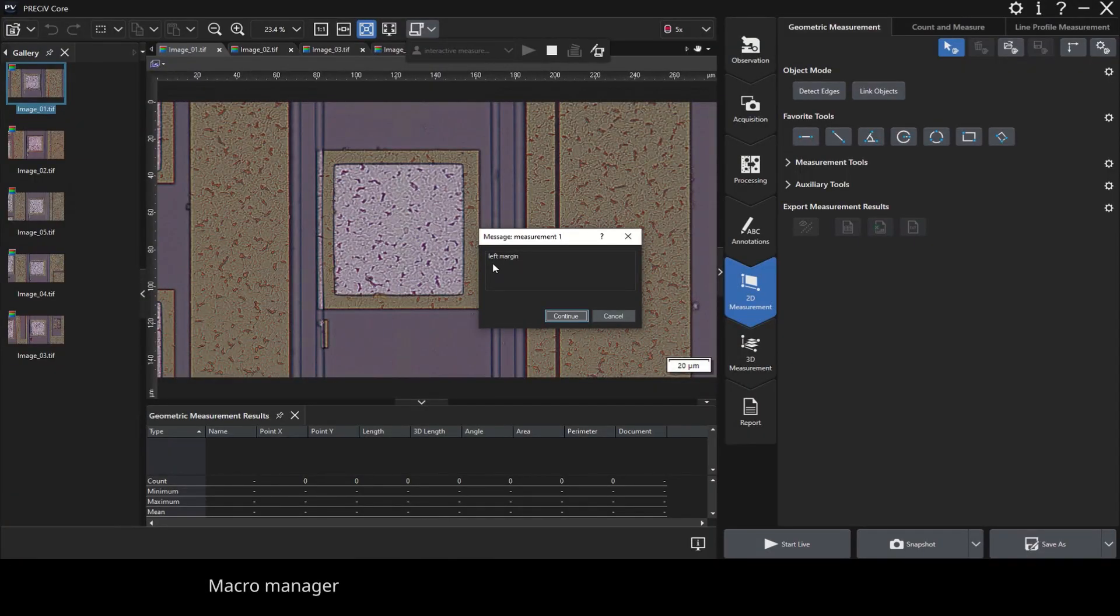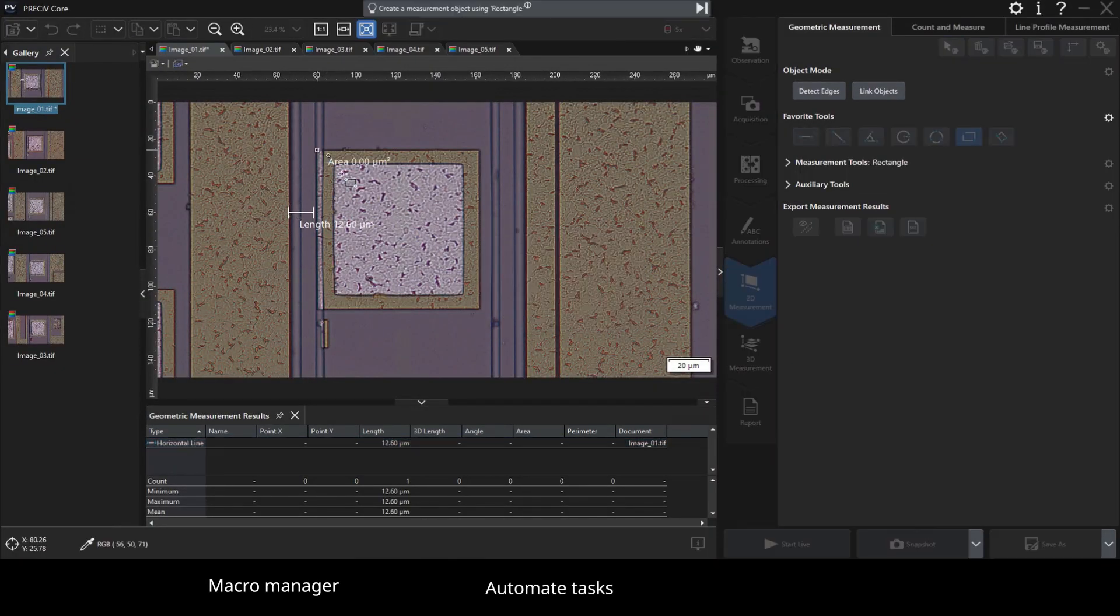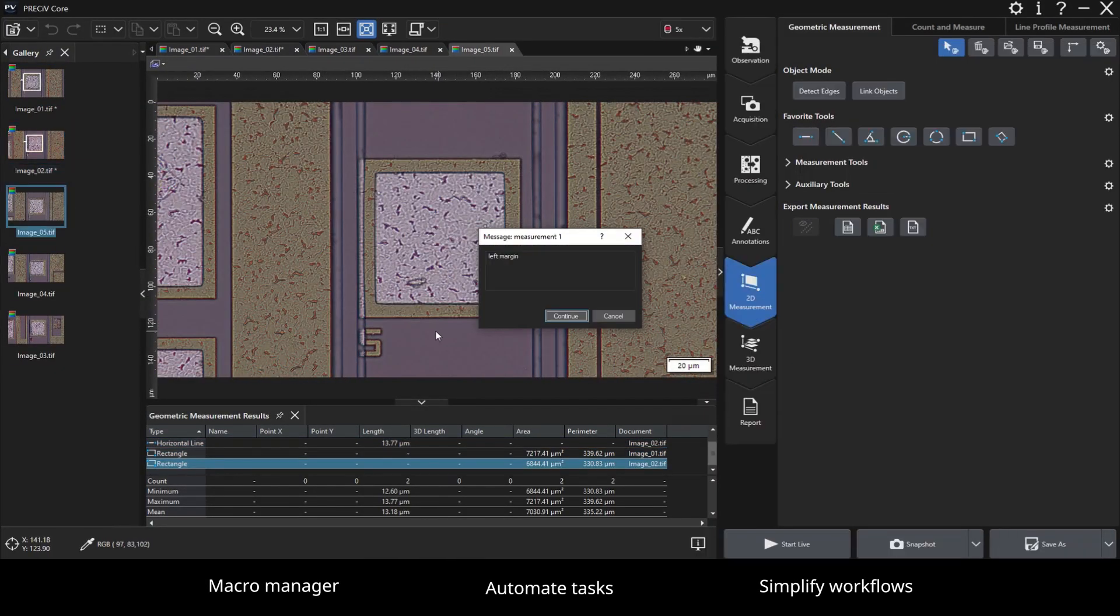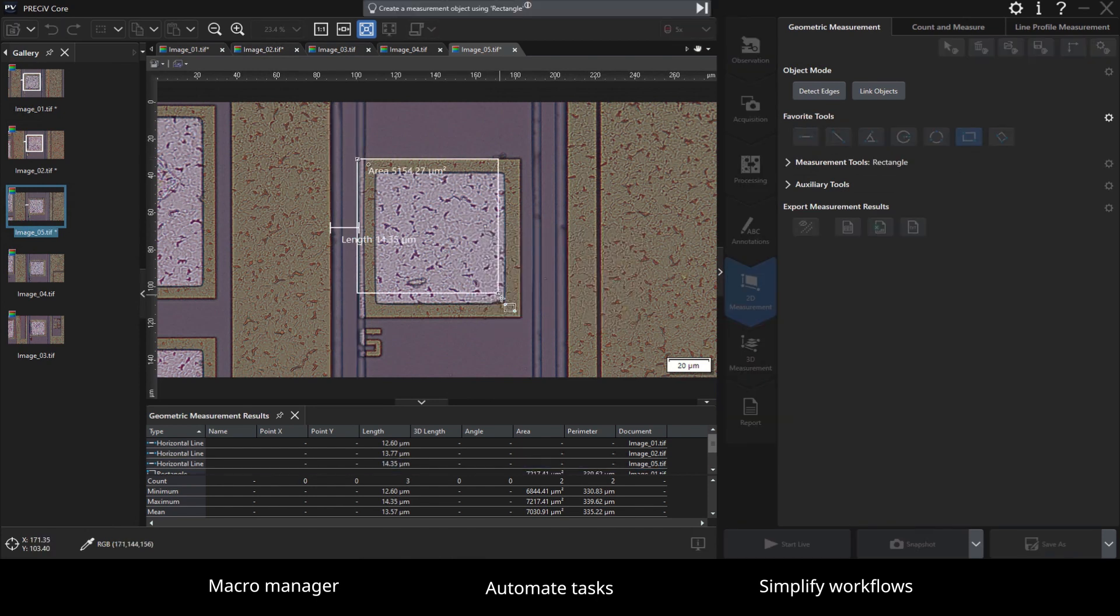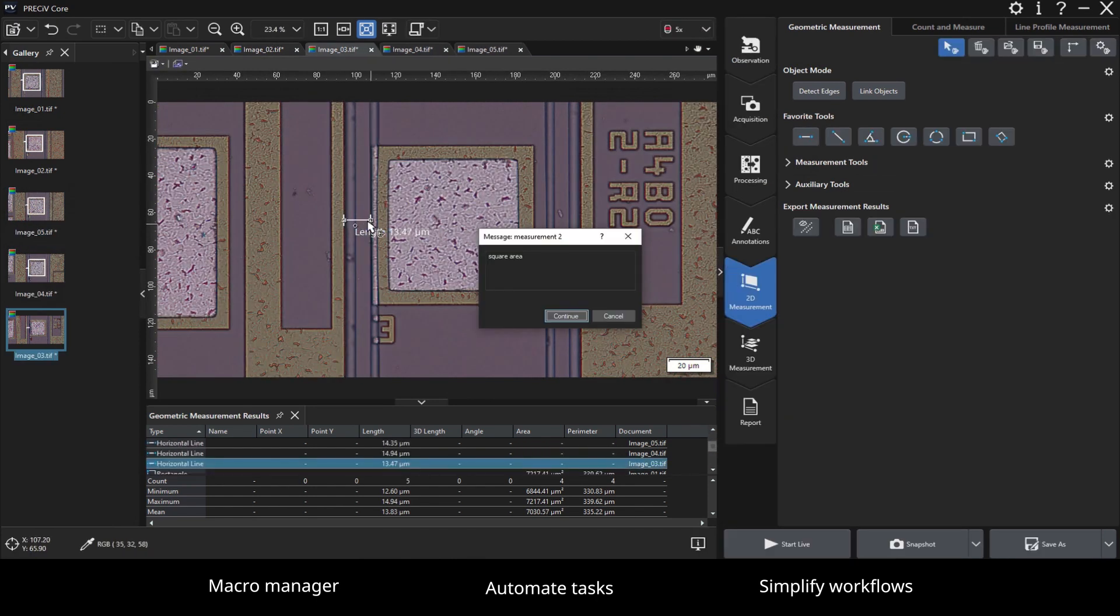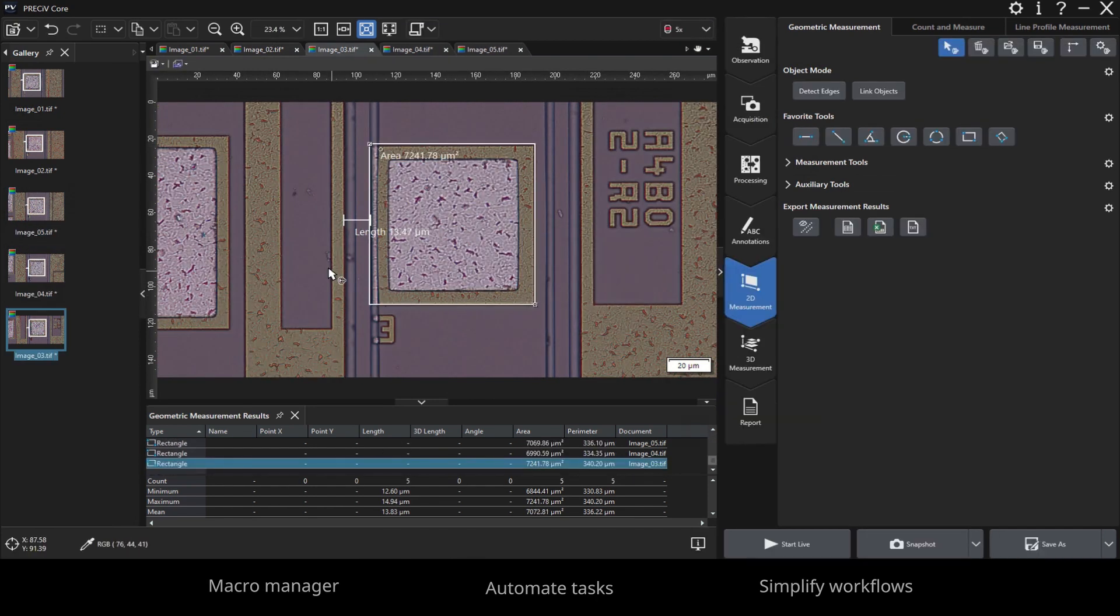Pressive Software also supports macros to automate repetitive tasks and simplify workflows, making your work more efficient.